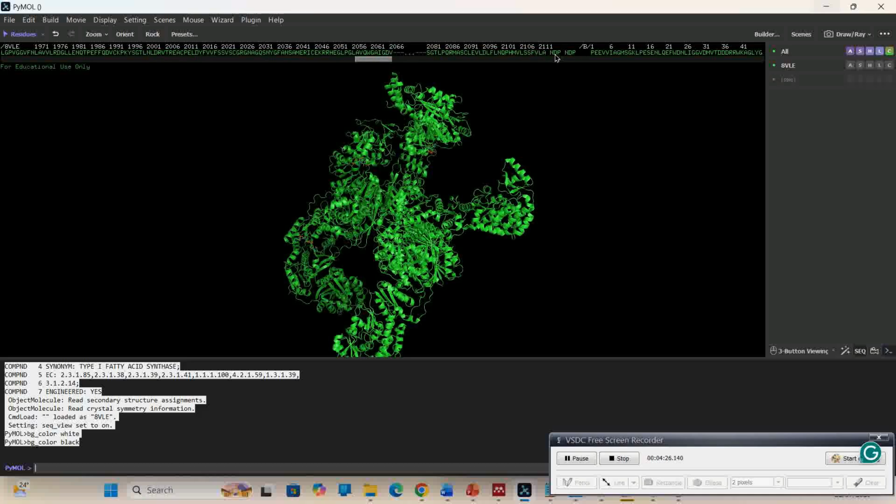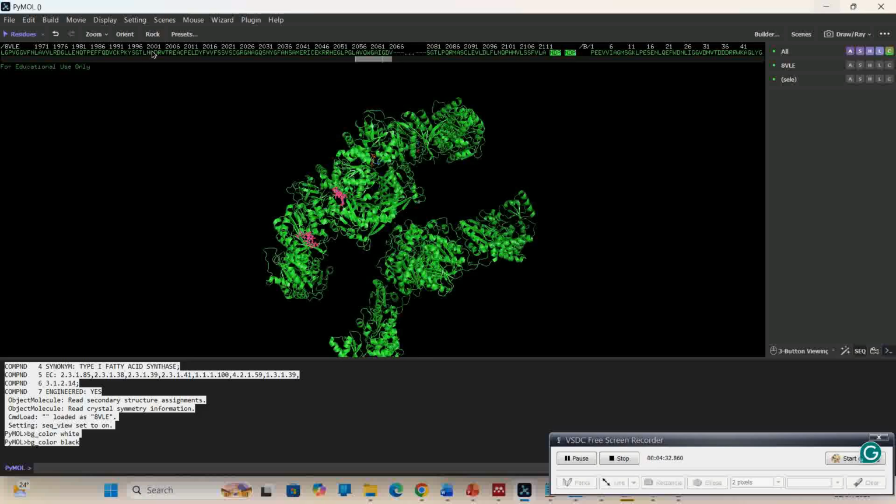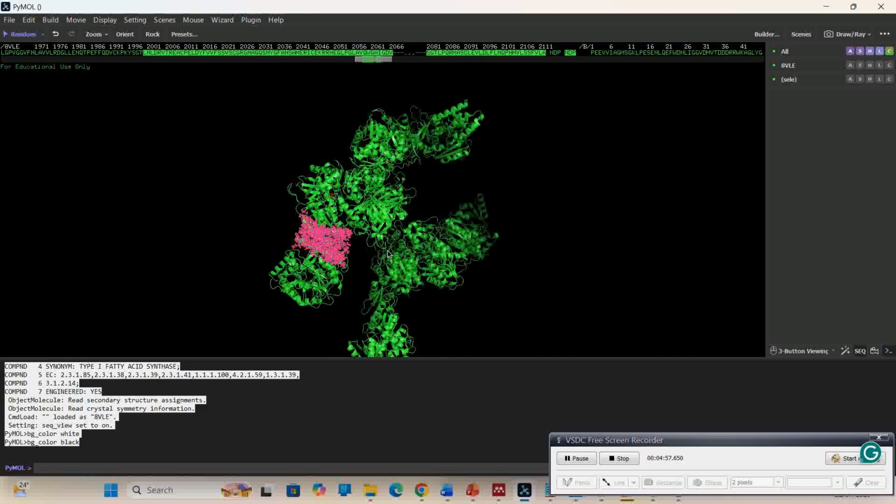Okay, I'll start again. This is the first one, and this is the second one here. So looking at it, we have from 2000 down. So it means we do not need this other one out here. I'll take this one out. Now it's no longer selected. Remember, what we're trying to do is save a part of the entire protein that will be useful for our work.